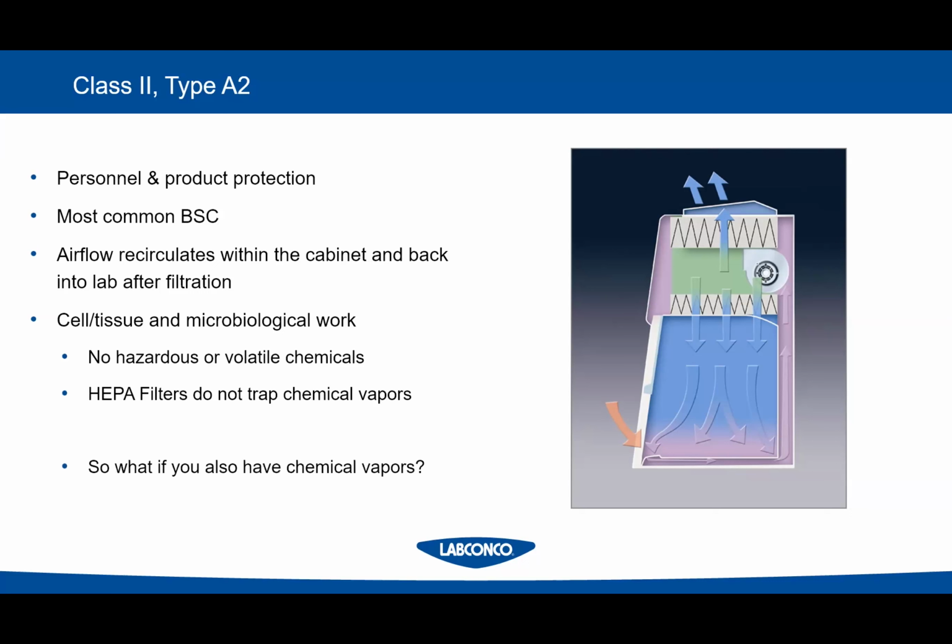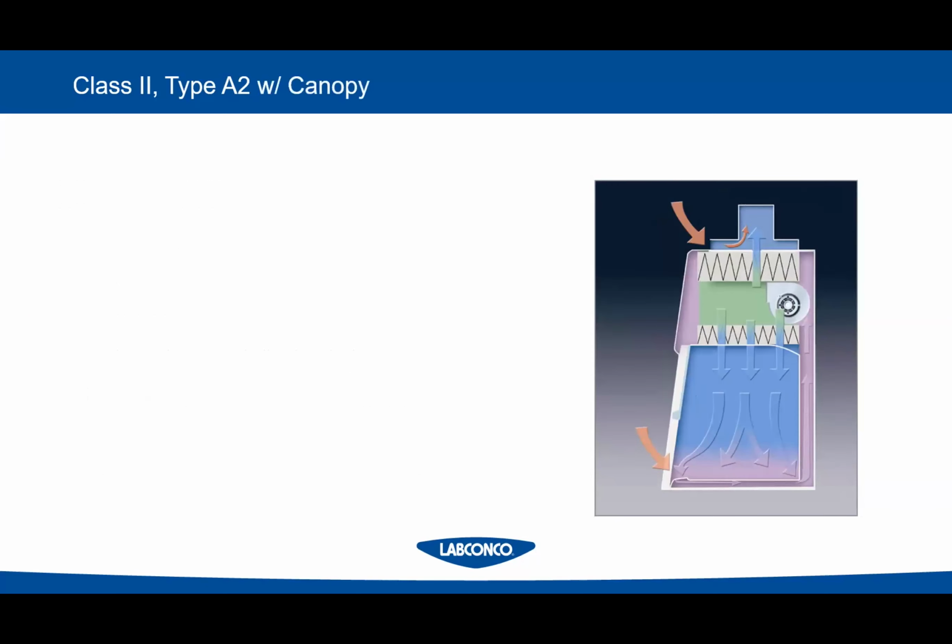Okay? So what if you have chemical vapors and you have these on your campus? What do you do? What do you do for those people? What we do is we add a canopy to the top.